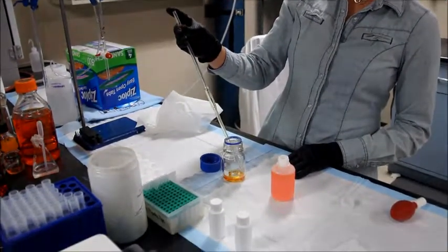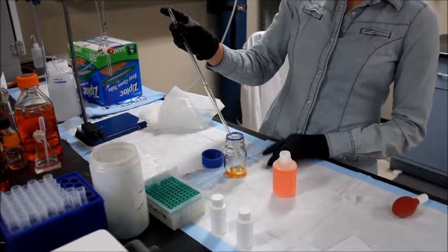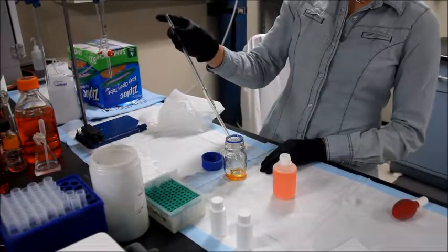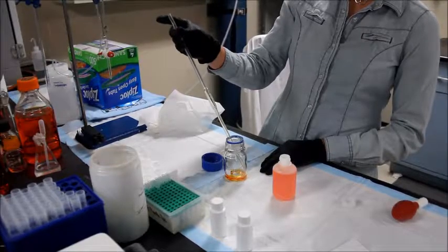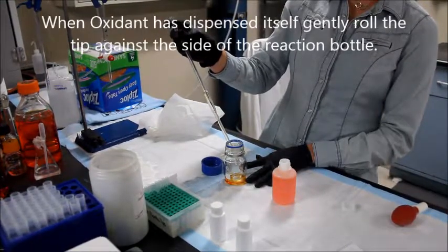Allow it to drain completely on its own. Do not blow the liquid out. When it's done, gently tap and roll the tip against the bottle to make sure everything is out.